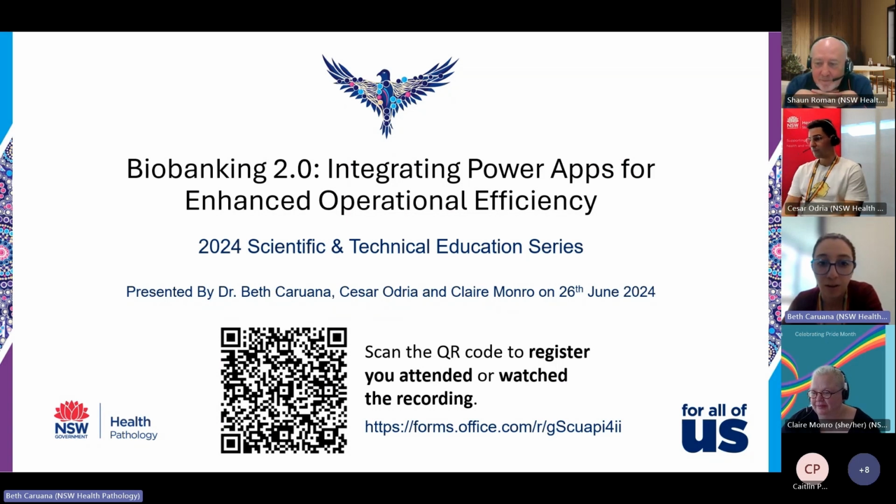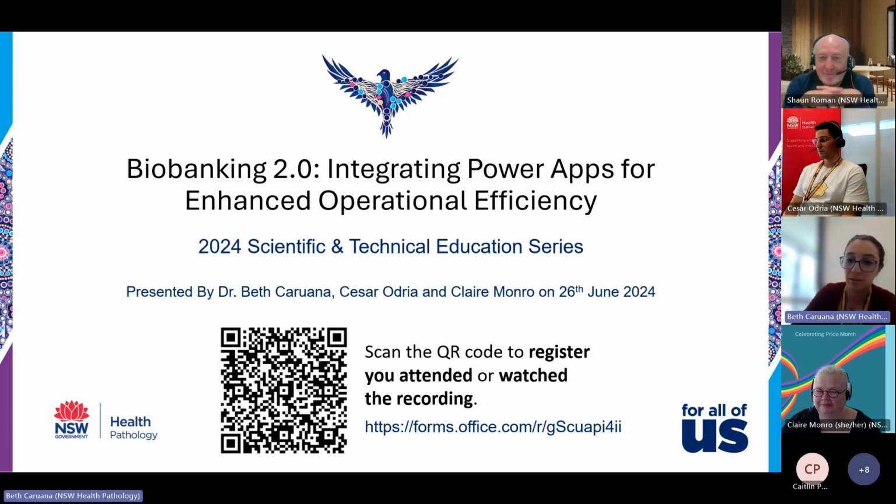Today, myself, I'm the senior scientist at the statewide biobank, is joined by Caesar, who's a technical officer at the biobank, and Claire Munro, who works for DevOps. So today we'll be talking about Biobanking 2.0, integrating Power Apps for enhanced operational efficiency.